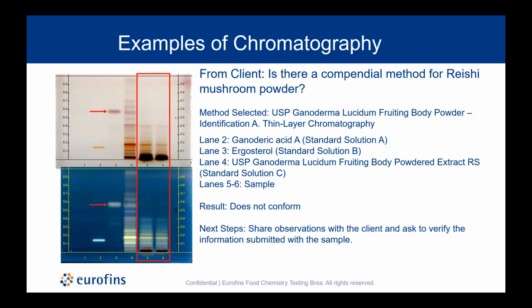We want to talk about the report that we've provided so that we can make sure that there is an equal understanding on both sides of the testing that was performed and of the sample material that was submitted, as well as the information that was submitted with the sample. So going back to one of the previous slides about what information is required to identify the fit for purpose testing, we want to confirm that that information was correct.